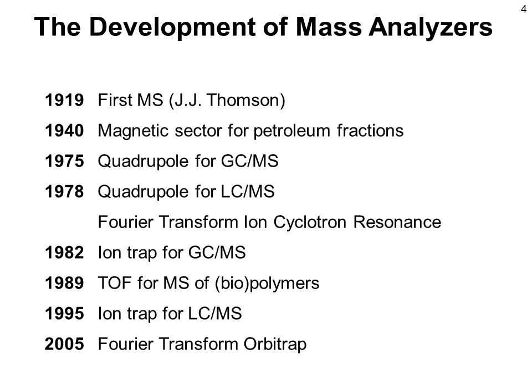1989 saw the advent of the time-of-flight mass analyzer, a completely different concept. Here essentially the flight time of ions is measured, and this flight time is related to their mass-to-charge ratio, as we will see later on. The interesting feature of the time-of-flight mass analyzer is that it is not limited by the mass-to-charge ratio, so you can use it to measure the mass-to-charge ratio of very heavy ions, such as those derived from biopolymers like proteins.